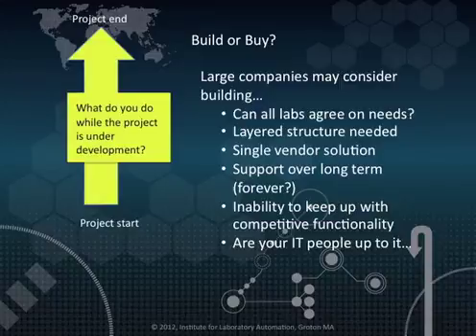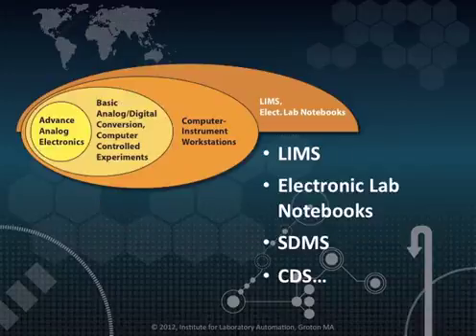Projects of this magnitude can take a long time to develop. What are your laboratories going to do to manage their lab work while the project is under development? Are laboratory managers willing to sacrifice effectiveness and productivity for the promise of an in-house developed system? Are you going to have to use a vendor-based product as an intermediate step? If so, how will you make the transition between the temporary solution and a long-term product?